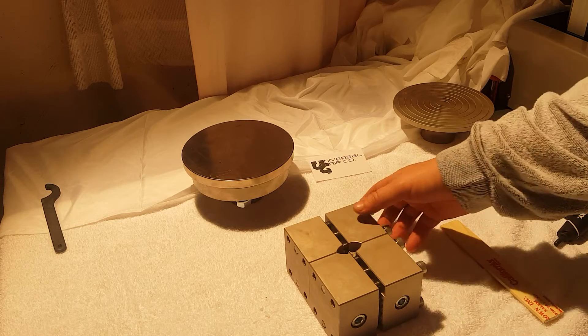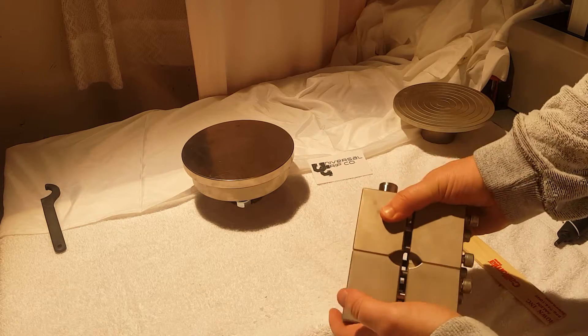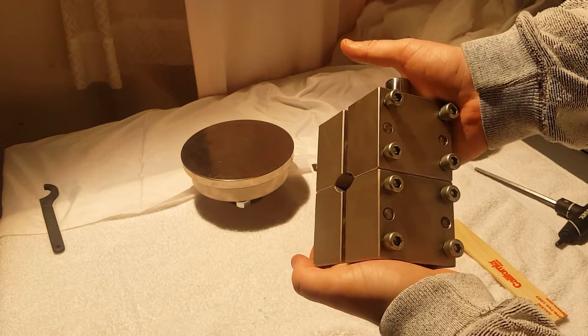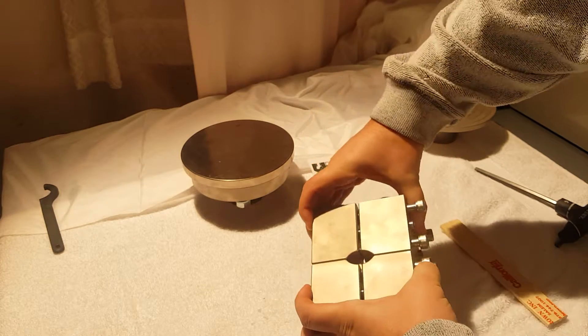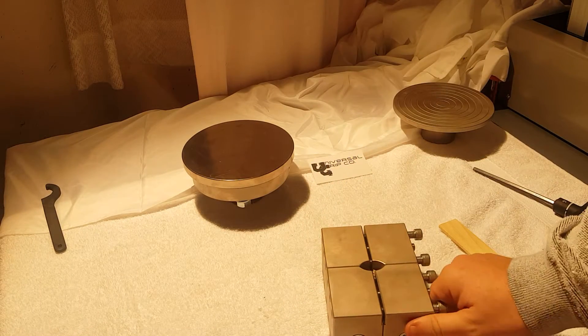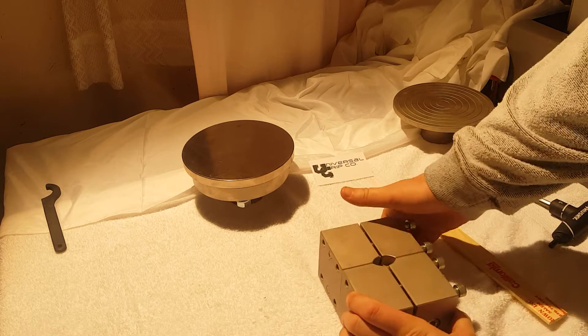Hello everyone. Today we are demonstrating the ASTM D6641 combined loading compression fixture. This fixture is used to compress composite sample specimens and test for things like shear strength, compressive strength, modulus, and a few other parameters.